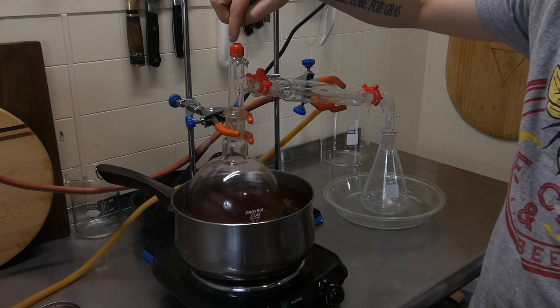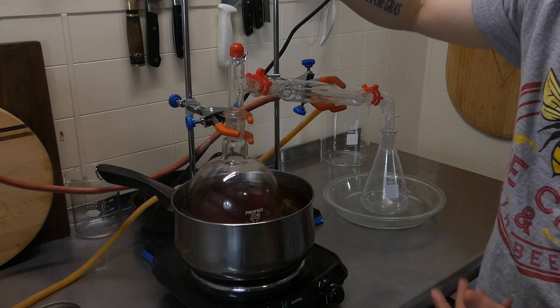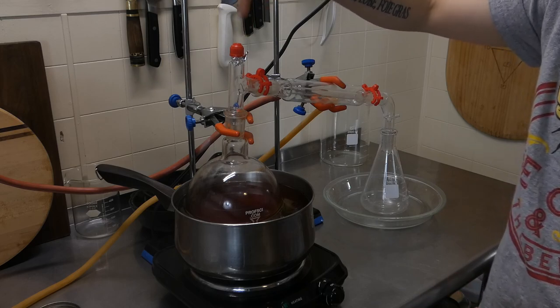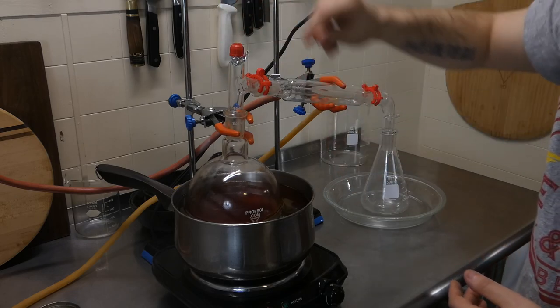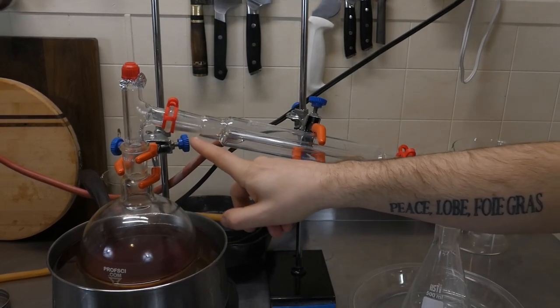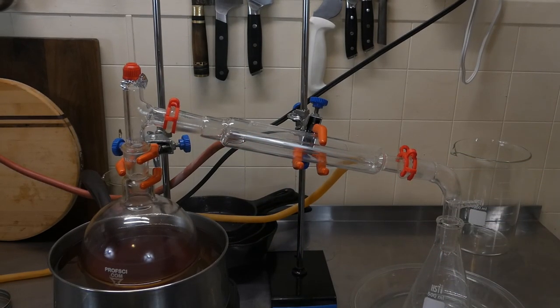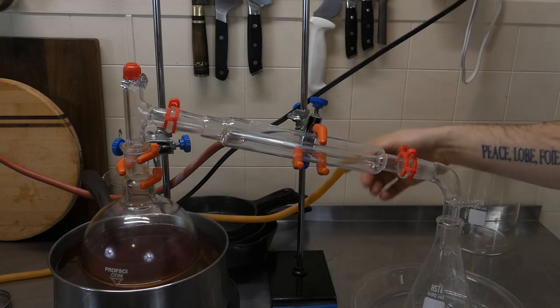As you can see, I have tin foil underneath it and it's screwed on. Normally you'd put a thermometer in there, but we don't need that, so I just screwed it on so nothing escapes. Then down here, we have the distillation column.